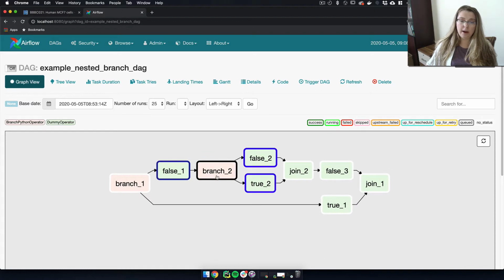And then say you have something here and you need to make some kind of programmatic decision about what happens next. Maybe in your analysis you're doing some QC, and if it hits a certain threshold, you go to the next part. And if it doesn't hit some certain threshold, you do some more examination on the QC side. You know, things like this. So being able to make programmatic decisions about your workflows, these are all really nice bonuses.